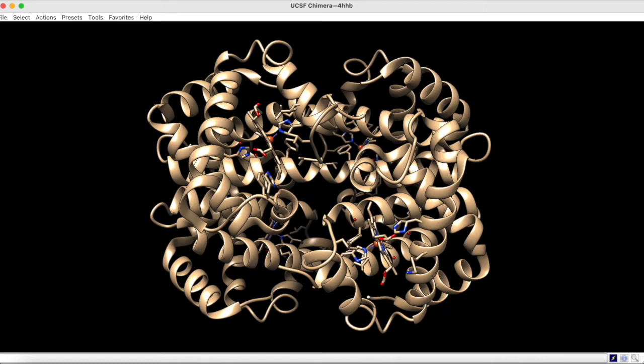If you have been following along with this series of tutorials, you may have noticed that there is no undo within Chimera, other than the undo selection feature. In this final video, we will explore 3 workarounds for this issue, using the hemoglobin structure 4HHB.